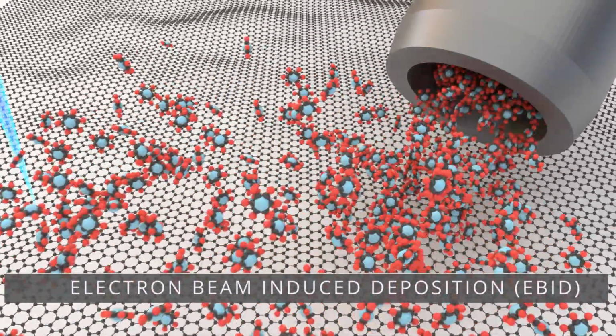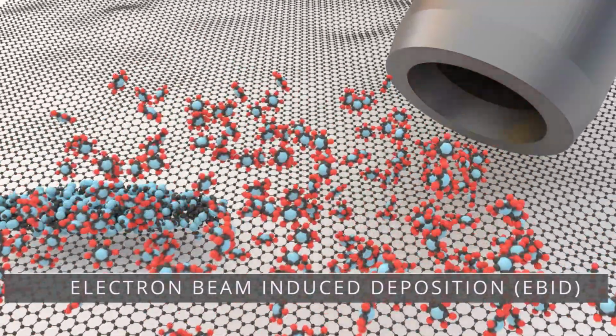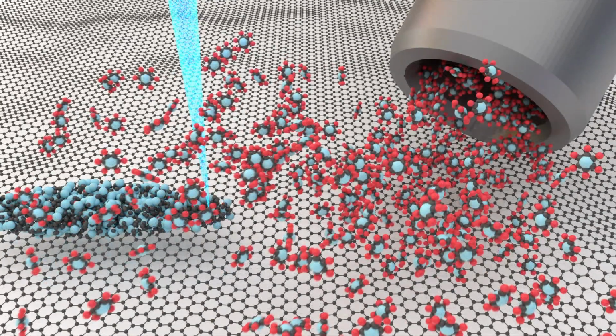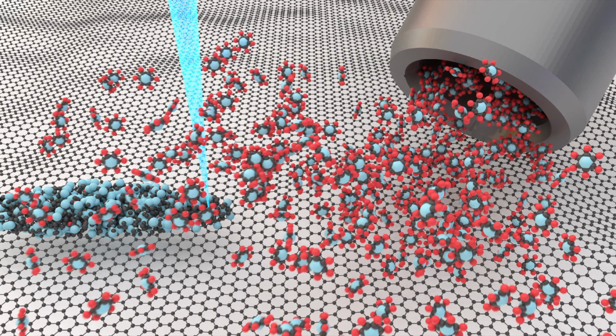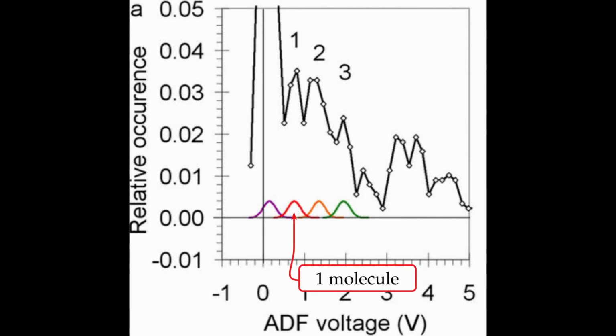Electron beam-induced deposition, or EBID, is a technique where a precursor gas is flowed across a substrate. The electron beam is used to dissociate the precursor into chemically reactive fragments. These fragments then spontaneously bond to the substrate, leaving a deposit. We can describe this process as a synthesis reaction in a CSE generated by the interaction volume of the electron beam and the materials. EBID is typically performed in an SEM, but Van Dorp et al. performed a series of studies aimed at doing EBID in a STEM and pushing it to the limit of resolution. Ultimately, they were able to show that they could deposit material molecule by molecule on a graphene surface.